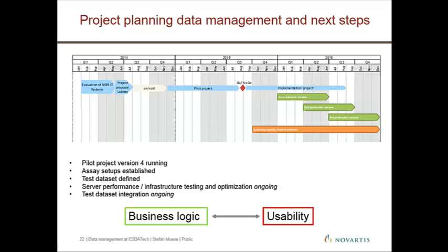My group is a screening group and the screening team, and we will have a specific screening-specific implementation, because we don't just want to capture the results data, but we also want to capture all the raw data in the system, which makes a huge difference number-wise of data points. So this is where we are.